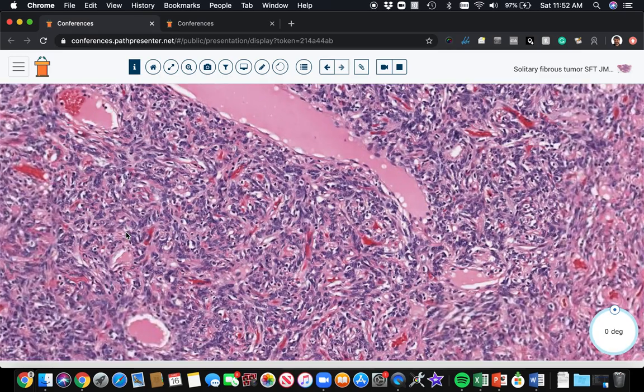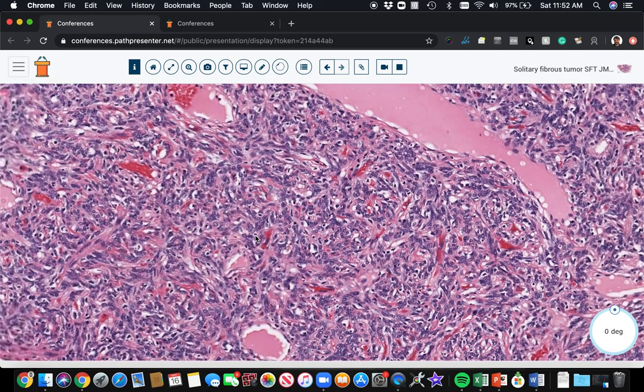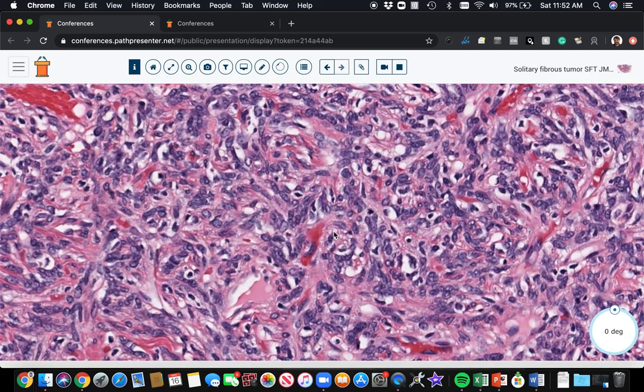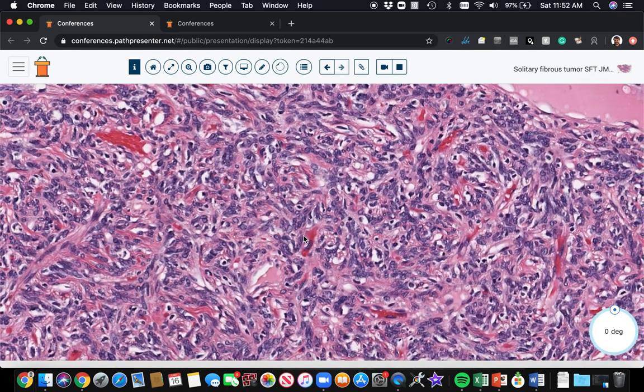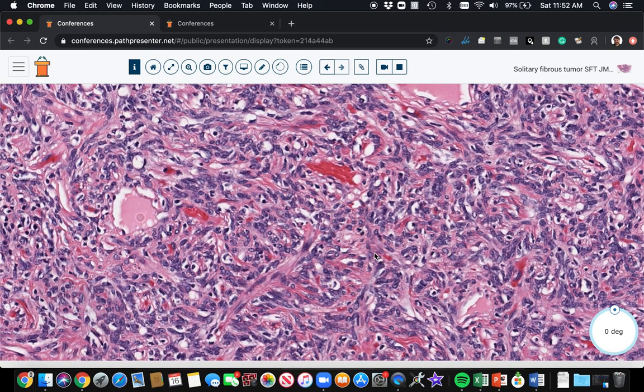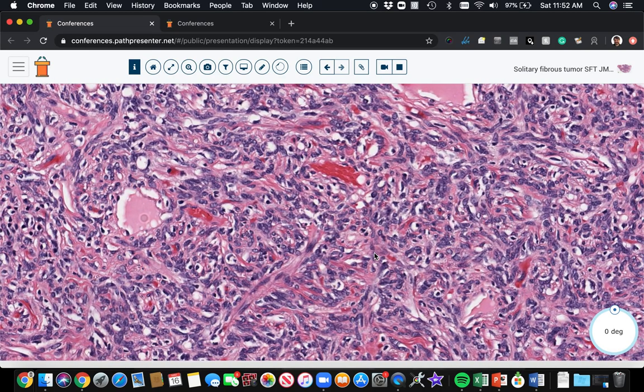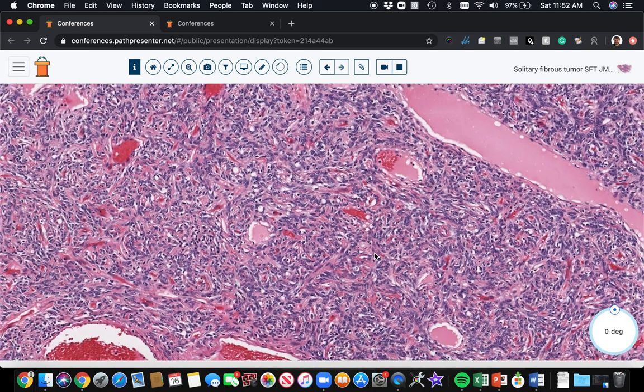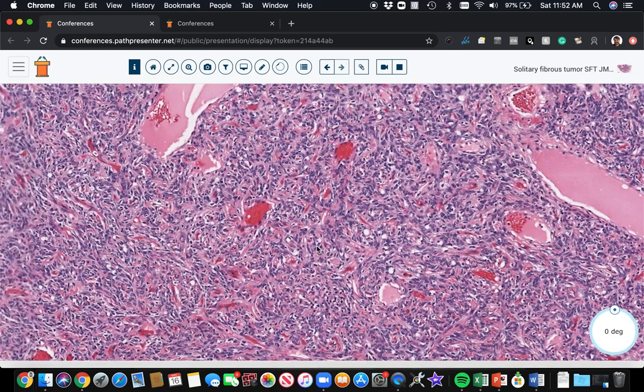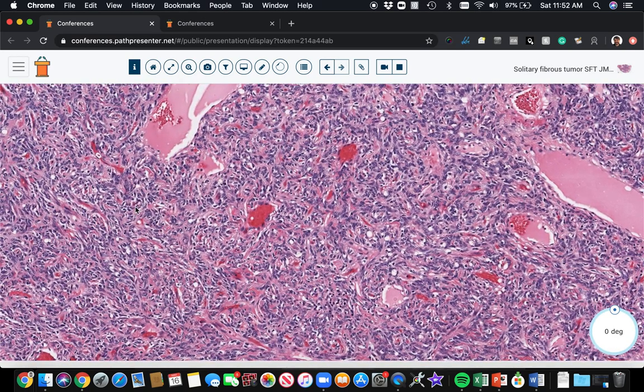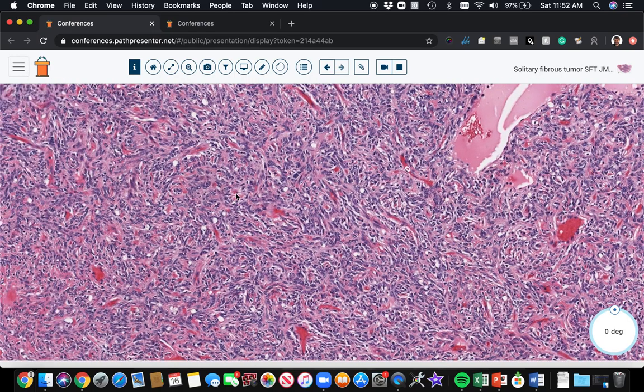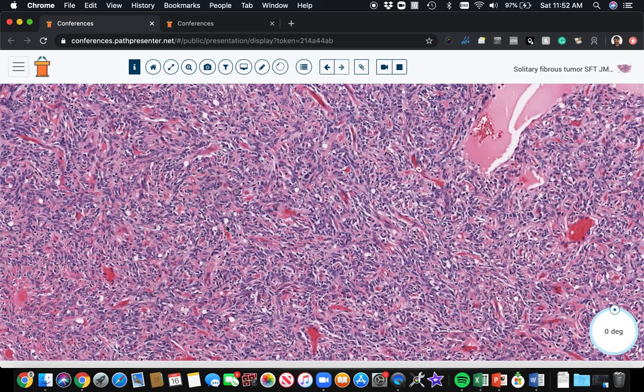And then over here in the more cellular zone, you can see the cells again, very bland. Usually there are malignant forms and high risk forms of SFT. That's a conversation for another day. But if you start seeing pleomorphism or a lot of mitoses or necrosis, those are features that can concern you that maybe you're dealing with one of the higher risk forms.